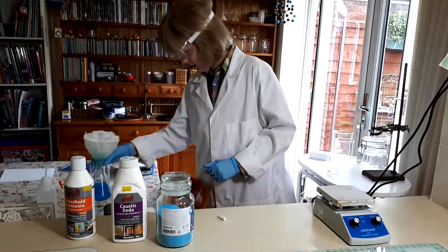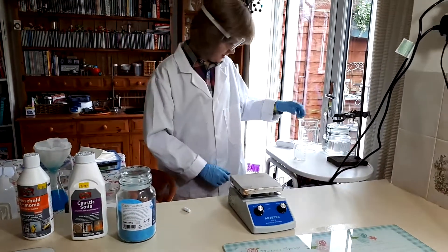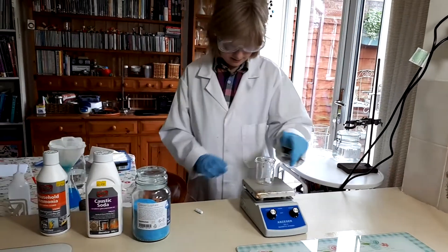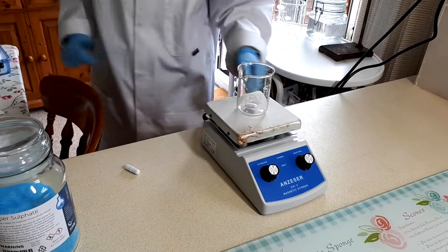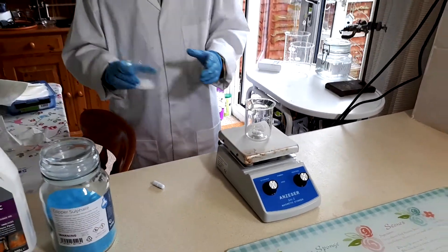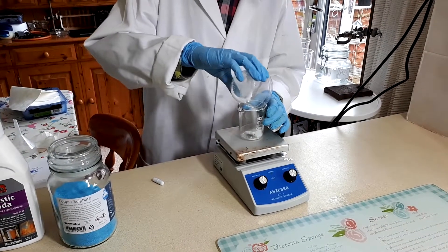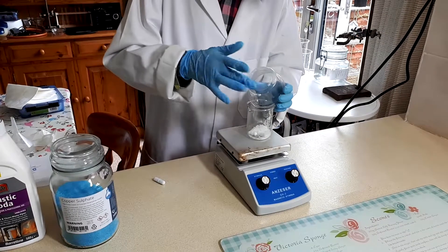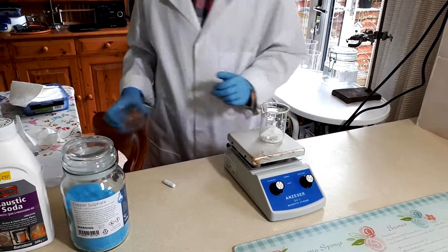While this filters off, we're going to make a sodium hydroxide solution. I'm going to do this in a smaller beaker — get about 8 grams of sodium hydroxide and dump it all in there.